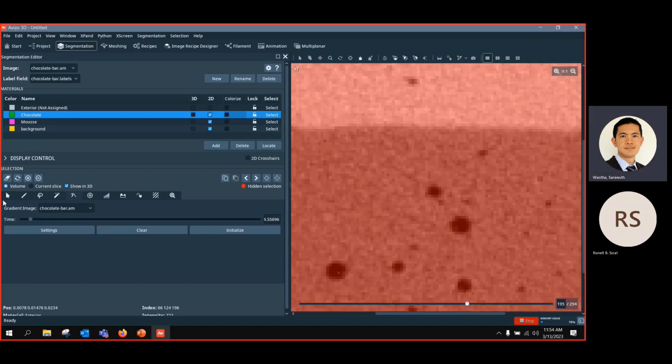Okay, I didn't get it to work. I wonder why. Sorry for this. I will have to get back to you on this issue. Not sure. Okay, I stopped it. So we skip the propagating tool for now.